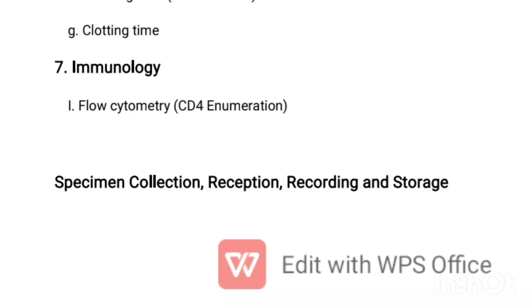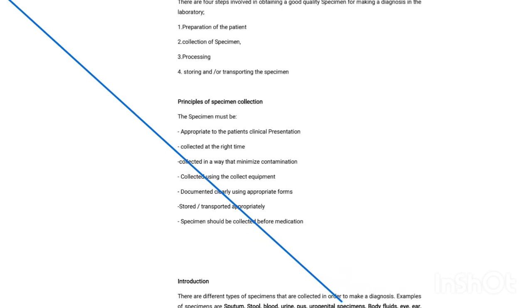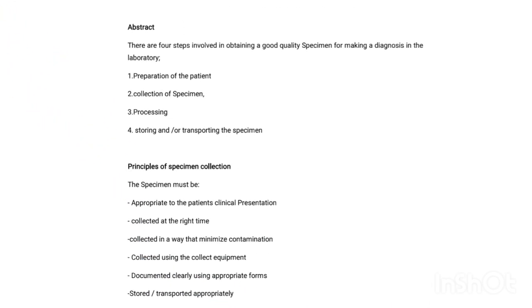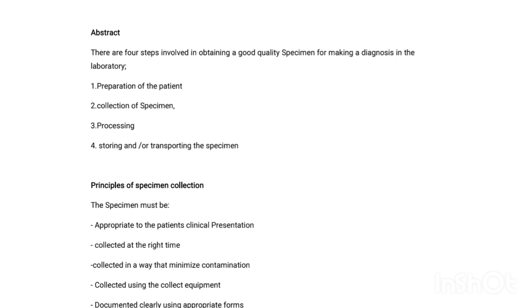Okay, now we can begin our discussion by considering specimen collection, reception, recording, and storage. So we can begin. We see what is involved under specimen collection. Okay, so now this is the abstract. The same thing that I'm going to explain is what happens during laboratory work.